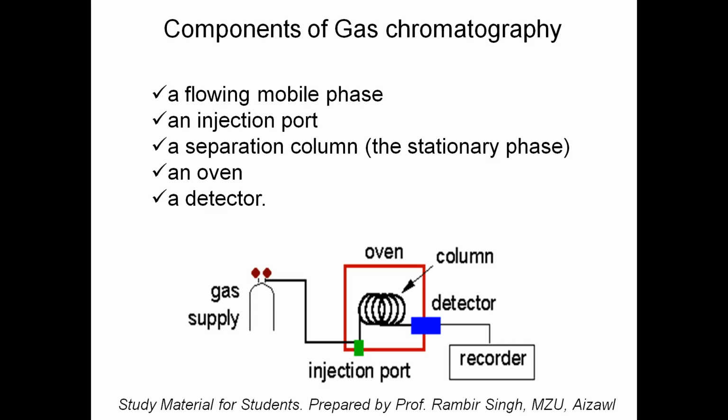If we have to keep it in vapor state, we have to keep it always heated, right? So this is one difference between gas chromatography and HPLC.